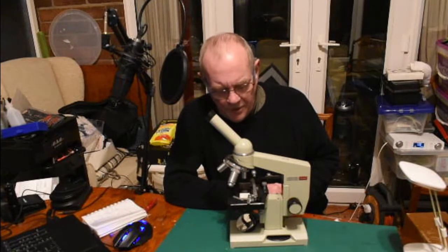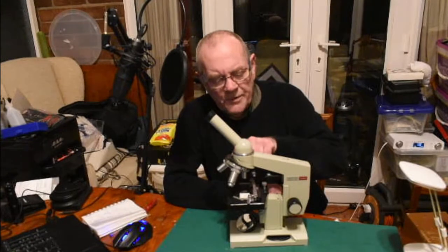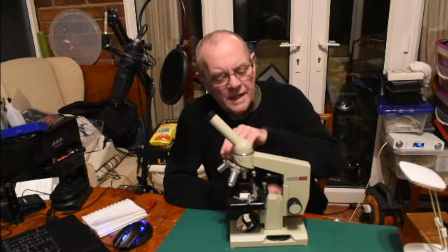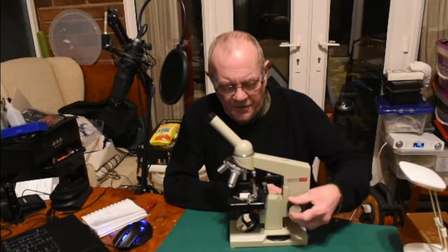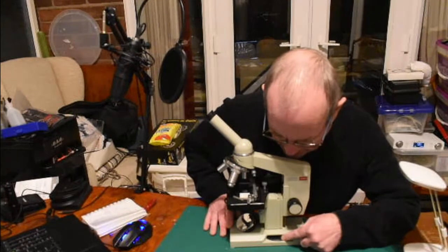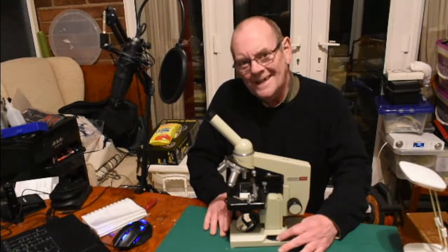There are a couple of points I'd suggest you look at before purchasing one of these. The main thing comes down to the focusing. The optics you get on any of these models are all the same — they're beautiful — so that's not an issue as long as they're clean and haven't got any mould inside them. If you're buying off eBay, ask the seller: are the optics clean? You should get an honest answer. You also get a coarse focus to get onto your sample, and then there's the fine focus wheel which, although not essential, makes life a lot easier.